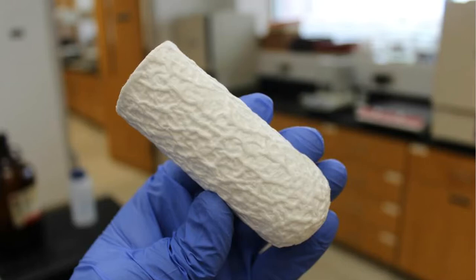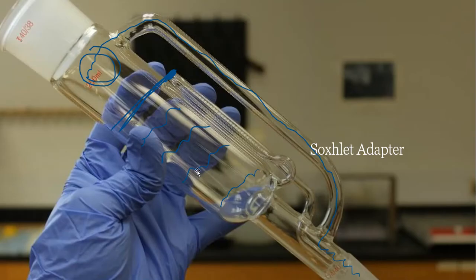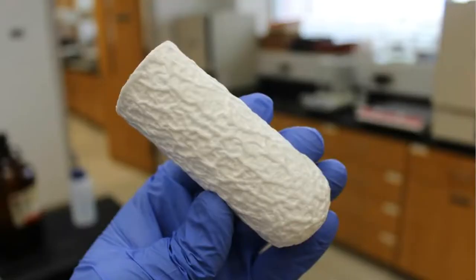Some people do not. Maybe in some of those videos that you watched, they did not use any thimbles, and they just crammed their material down into a Soxhlet extractor. Okay, well, that's great. Whatever floats their boat. But I'm not going to take the chance of looking at this Soxhlet extractor and having little small chunks that basically build up in this very narrow tubing. And it can happen anywhere. So why am I going to take that? This piece of glassware is expensive. And how am I going to clean all of that mess out if it does venture in there and get lodged or jammed? So that is the purpose of the thimble, and that's why we use them.